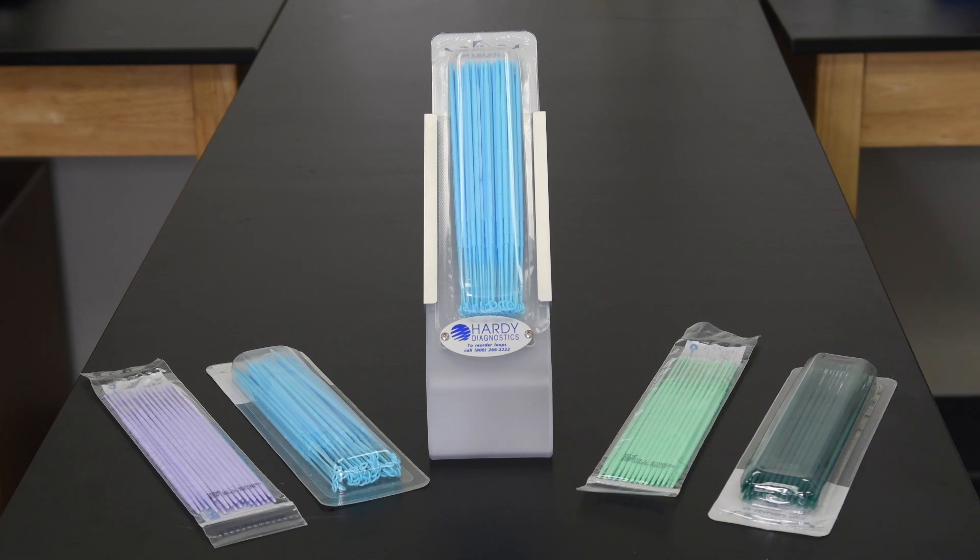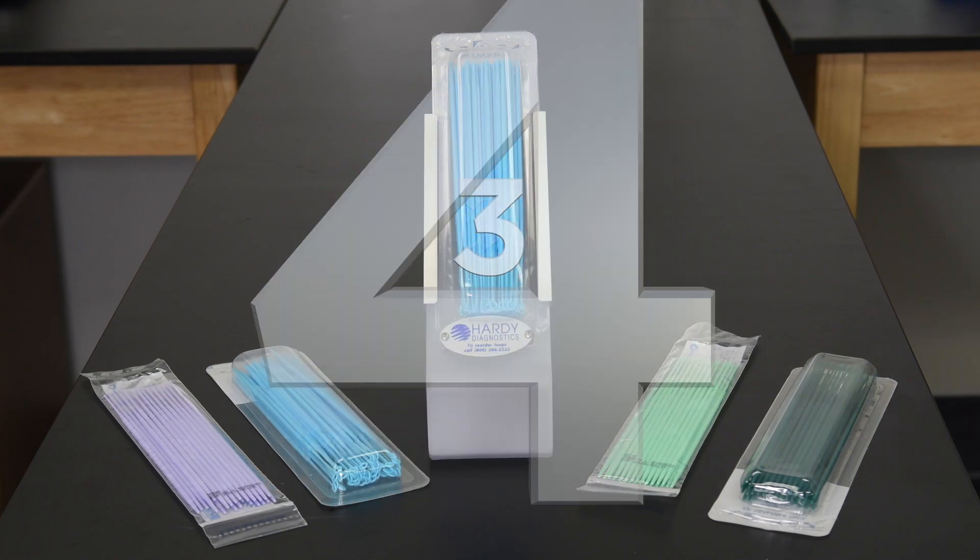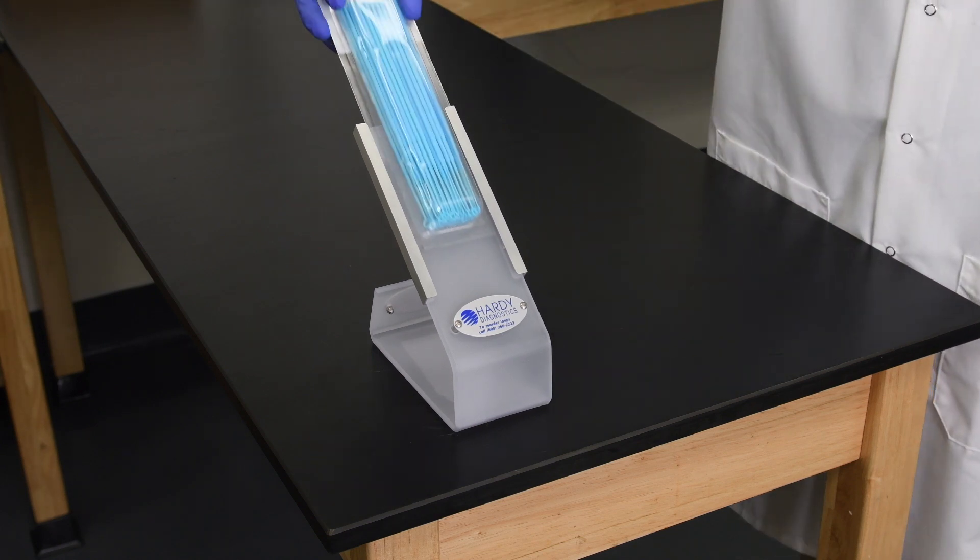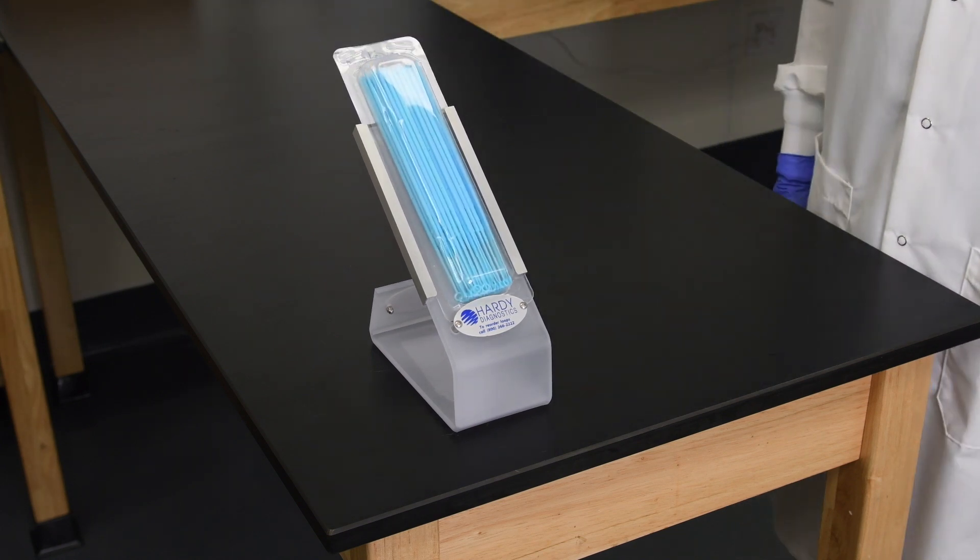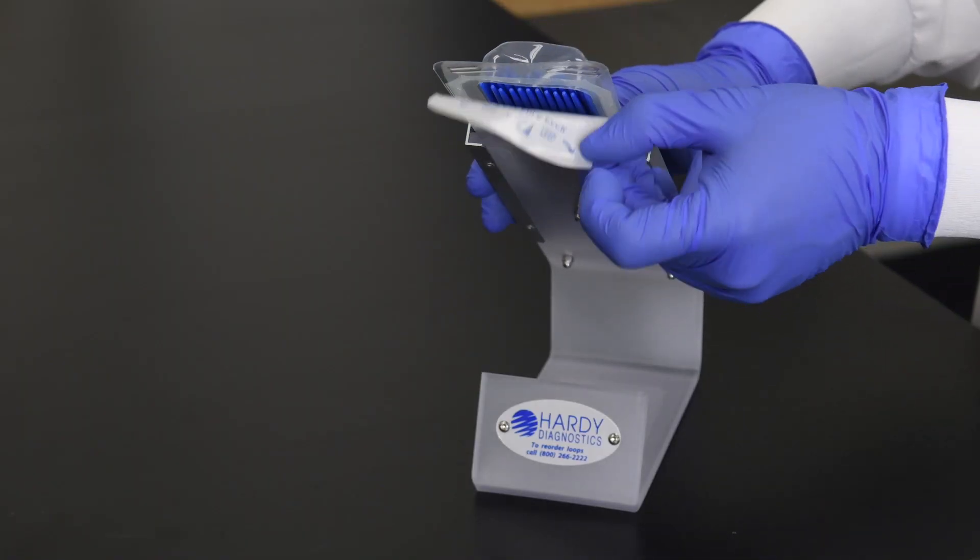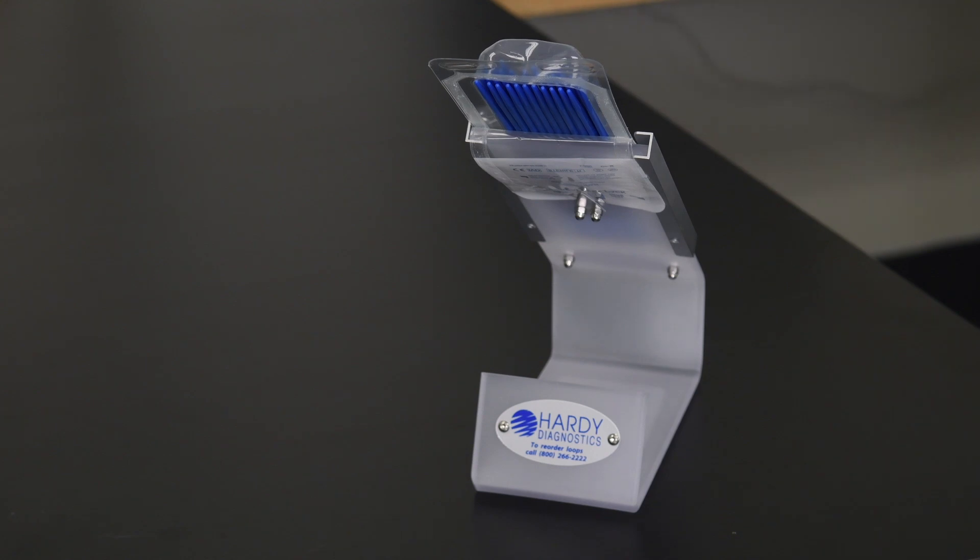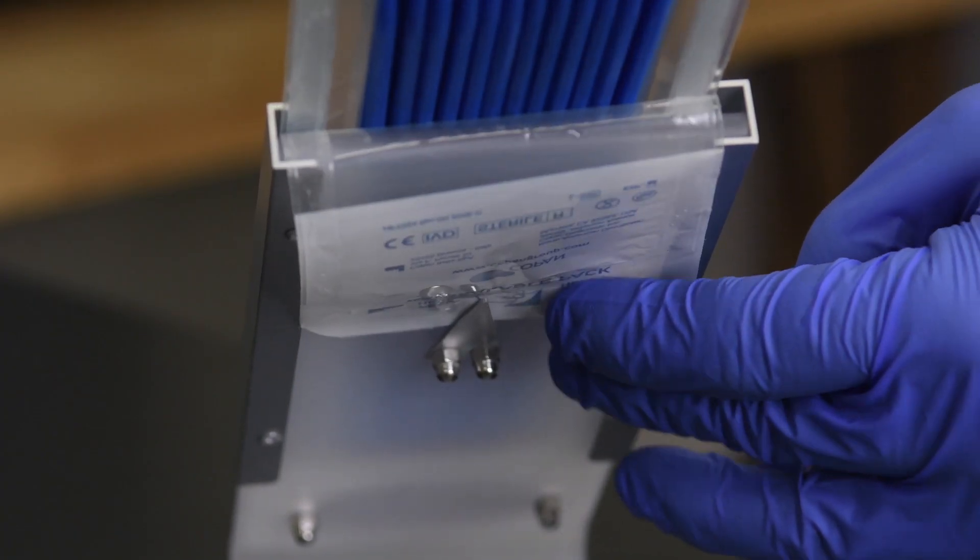Using the Loop Caddy is as simple as 1, 2, 3 and 4. First, slide the resealable loop pouch into the Loop Caddy so that the handles are at the top. Second, peel open the resealable tab on the top to expose the ends of the handles. Third, secure the tab into the clip.